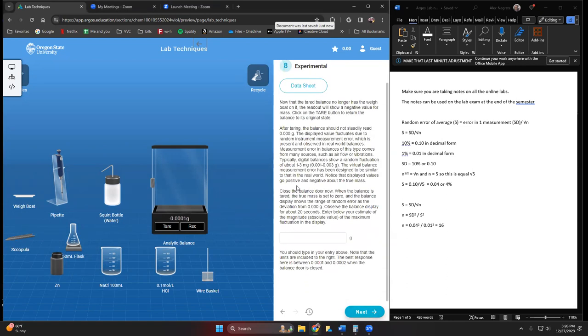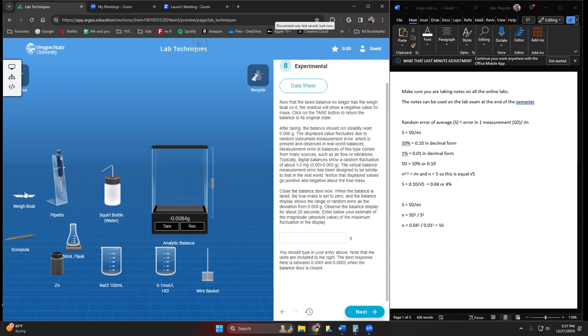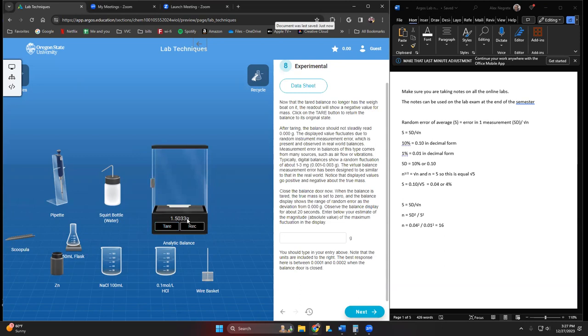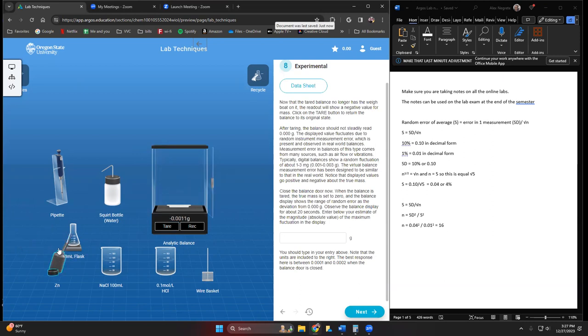We're going to open this up and put the wayboat in there. We want to tare this out, we want these values here to be zero, so we hit zero. Then I can put something in there, like for instance I'm going to put the zinc in here. Don't use Safari for this, don't use Microsoft Edge, don't use an iPad, cell phone, or tablet.